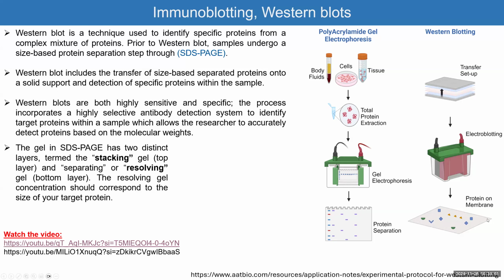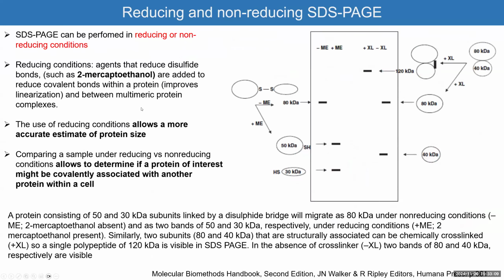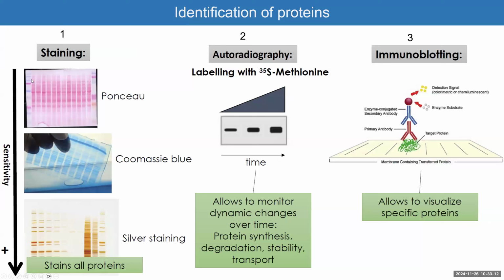So you end up having a copy paste of that gel with proteins all over, and it would look like the Ponceau here. So you have the molecular markers now. Instead of being on the gel, it will be on a membrane. So this is a piece of nitrocellulose paper. It's very thin, it's very delicate, and you have all the proteins. So each sample is indicated in those lanes. This researcher had a marker in the beginning and marker at the end, and it will retain the same size and the same band. So if you have a band here, it will be exactly the same band.